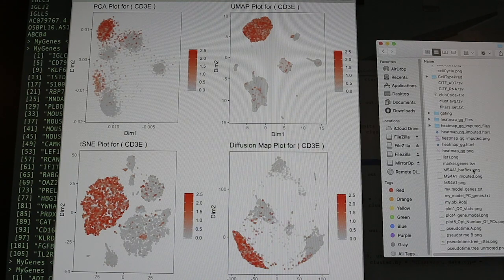So what do we believe, the transcriptome or the antibodies? Well, I think if they match and they match your expectations, it gives you more confidence. If they line up, they agree. It might be interesting to take all the cells that are positive for one that looks like it doesn't work, and see which transcripts are high in cells with high signal for that antibody.